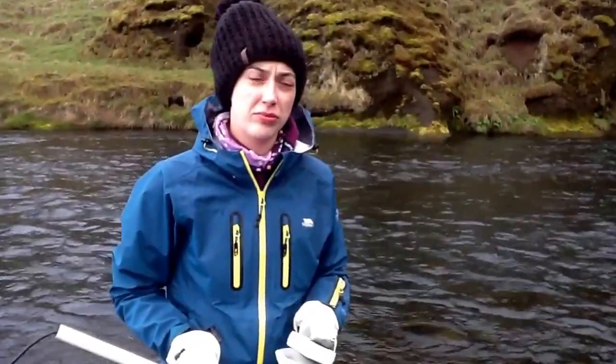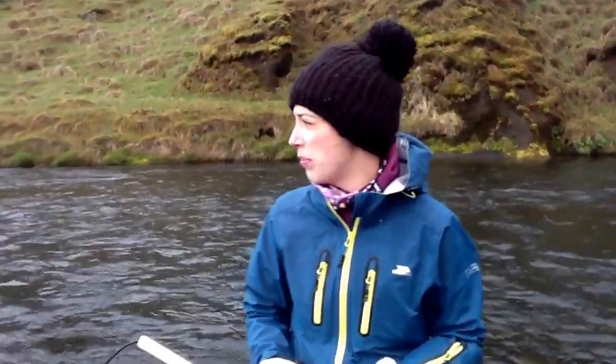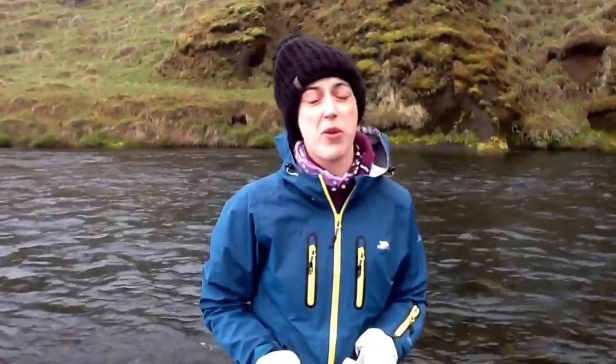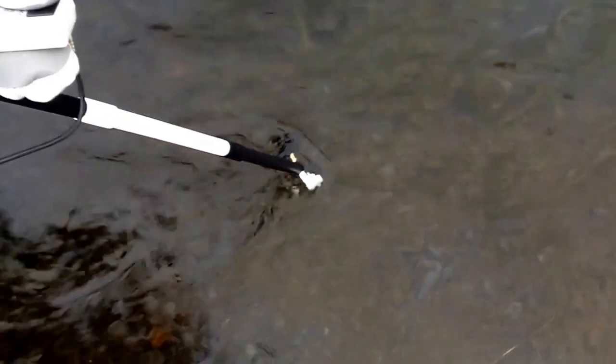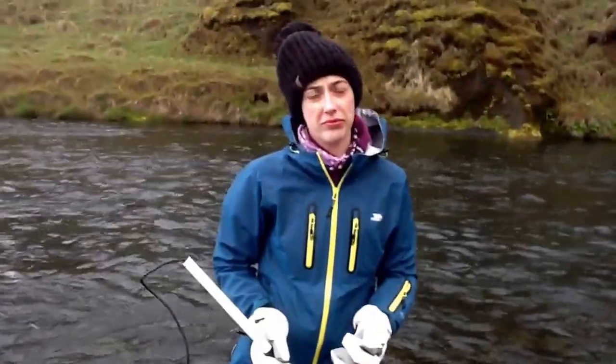What about in terms of nitrate content? We found nothing on the glacier earlier. Has it been any different down here or at the top of the waterfall? No, absolutely no nitrates down here either, which, considering the plant life around, is slightly suspicious, to be honest, and a bit odd. I think it's something we might need to investigate further. It could be a problem with our method, it could be a problem with our equipment, or there might just be no nitrates down here. Well, there are plants in the water, aren't there? If we look, you can see plants in the water, so it is quite surprising we haven't got any nitrates.